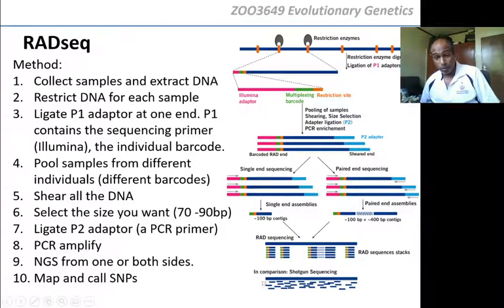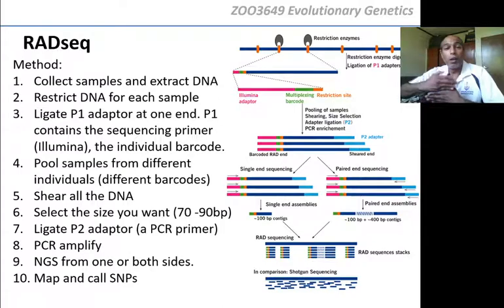Here you see all the little pieces that have been sequenced, little 70 to 90 base pair sequences, and we need to line them all up like this. Okay, we need to stack them all up and line them up. And so by doing that, we then know the DNA sequence, and the alignment. That's very important, right? Because without having them in a line, you can't say anything about the DNA sequence.